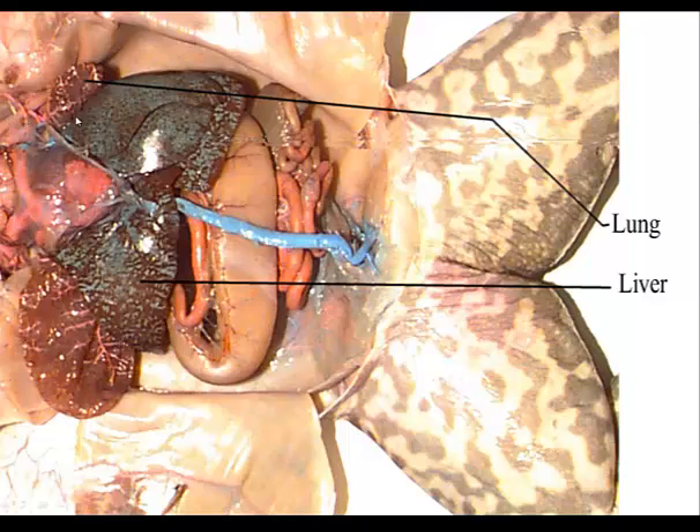Tracing down on top of the liver, which is this large black organ, are two small sacs on either side of the midline — these are the lungs. Make sure you're able to trace the passage of air from the external nares into the lungs.